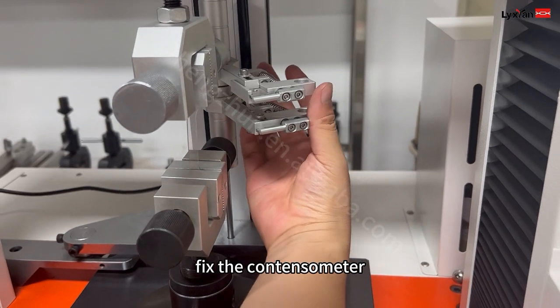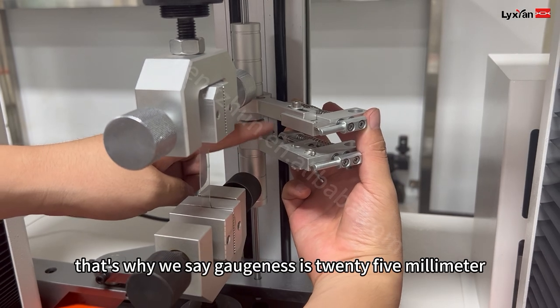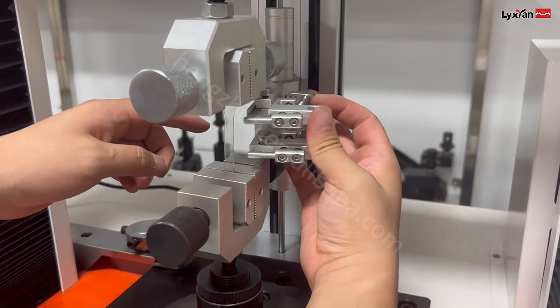Fix the distance. The distance is 25mm. That's why we say the gauge length is 25mm. It's a little bit.